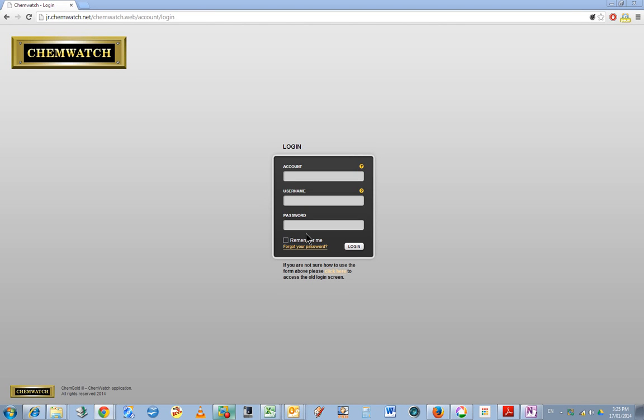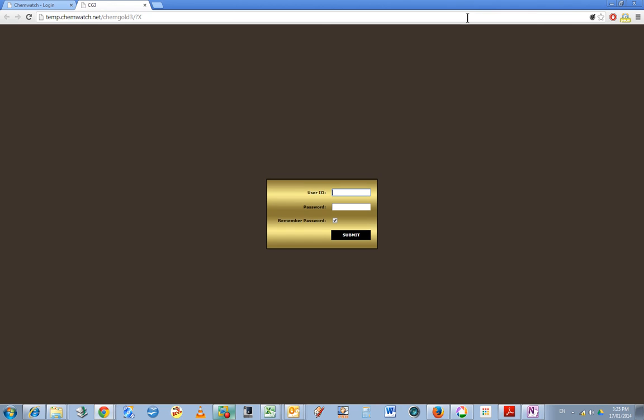I want to talk about ChemFFX. The link is jr.chemwatch.net/chemwatch.web/account/login. Until recently I've been using the older version of Chemwatch which looks like this on the login page and was called Chem Gold 3.